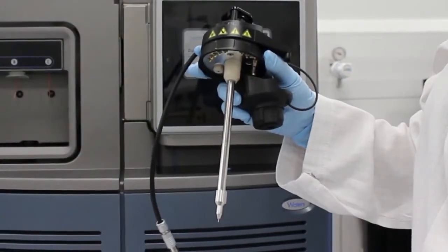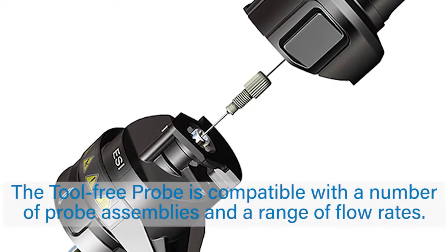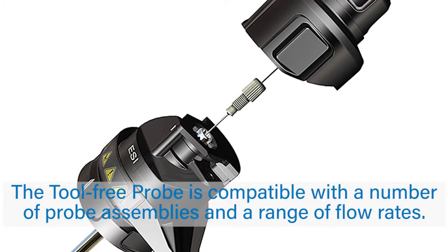Before installing the tool-free probe, switch the instrument to standby. The tool-free probe is compatible with a number of probe assemblies to accommodate a range of applications and flow rates.